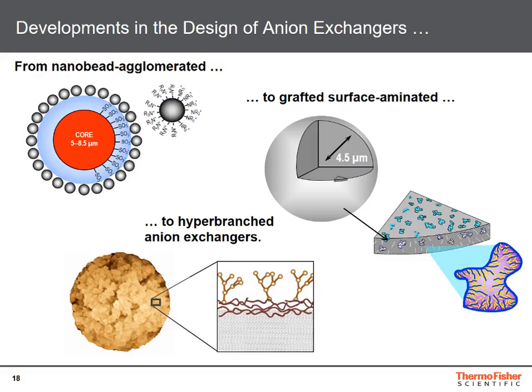In other words, these modern hyper-branched anion exchange columns are the ones with the highest chromatographic resolution today.